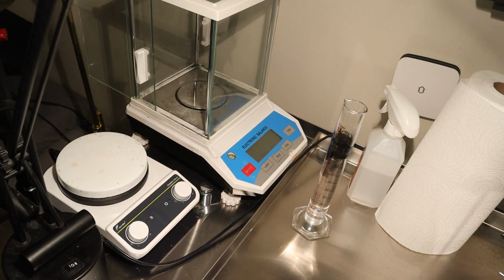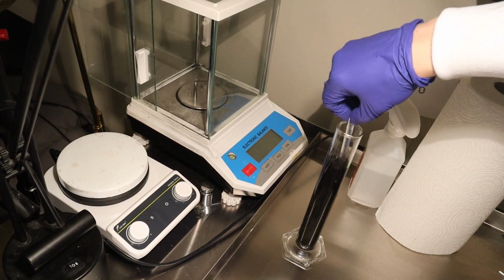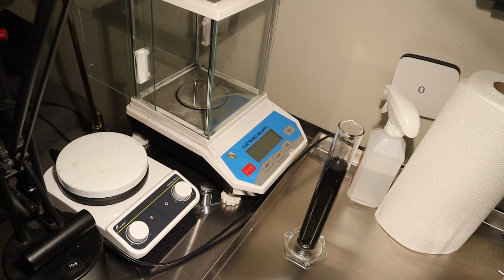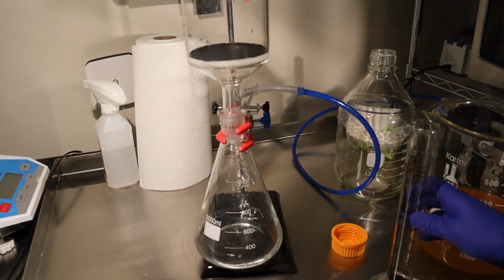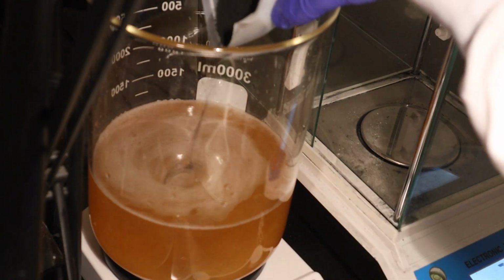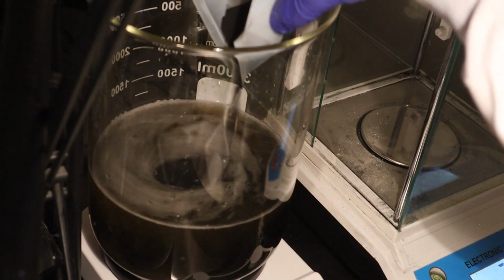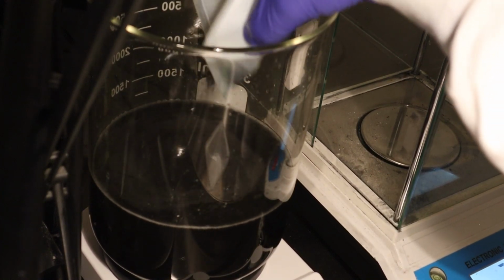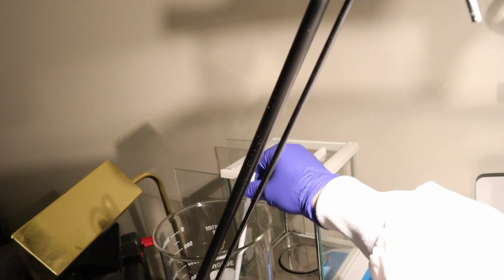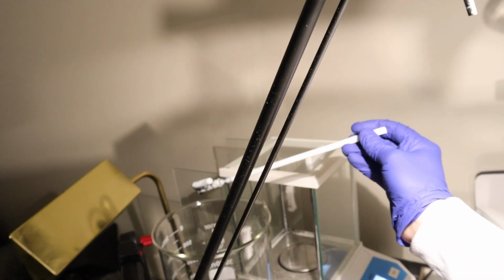I then made a test setup where I ran 1 gram of charcoal mixed with 99 mils of distilled water through the filter, and after seeing how successful it was, I decided the charcoal pellets weren't necessary at all, and added 20 grams of charcoal to the 500 mils I had filtered off, and stirred it for 30 minutes with my magnetic stirrer. After time was up, I got another filter circle ready and sealed in the Buchner funnel.